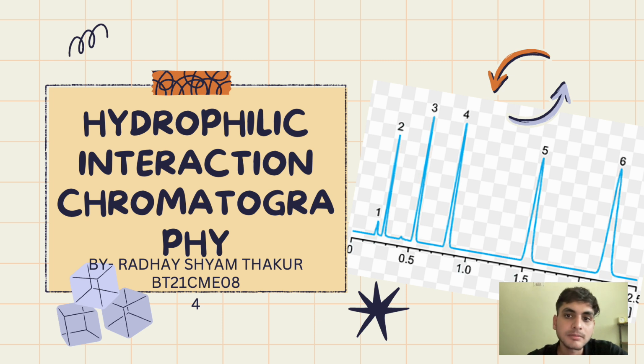In this presentation, we are going to learn about hydrophilic interaction chromatography. So let's first get to the definition of this. What do we mean by hydrophilic interaction chromatography?